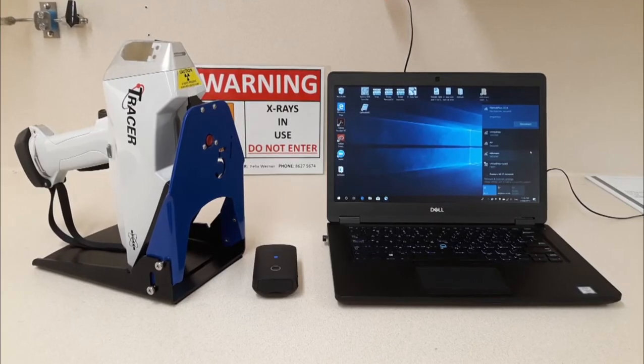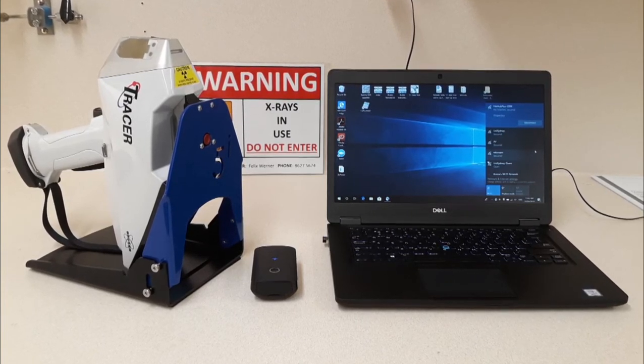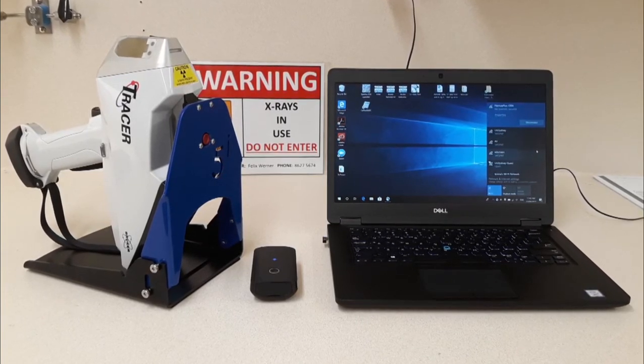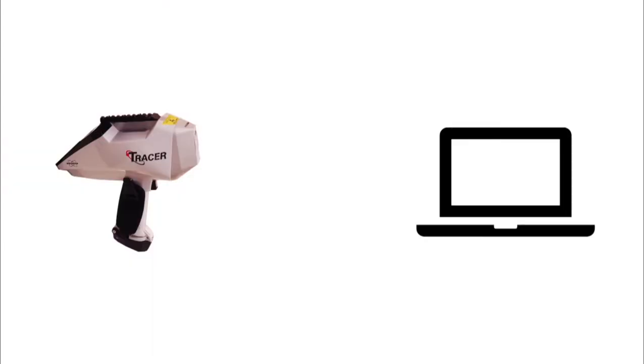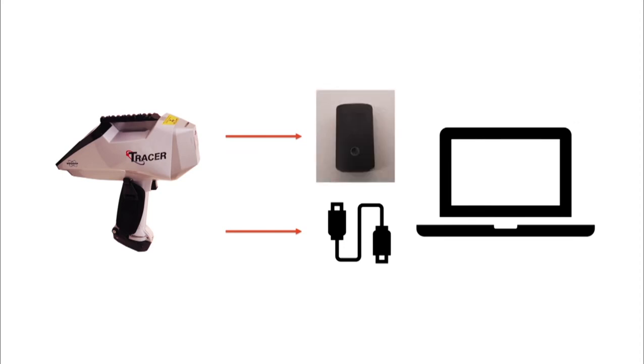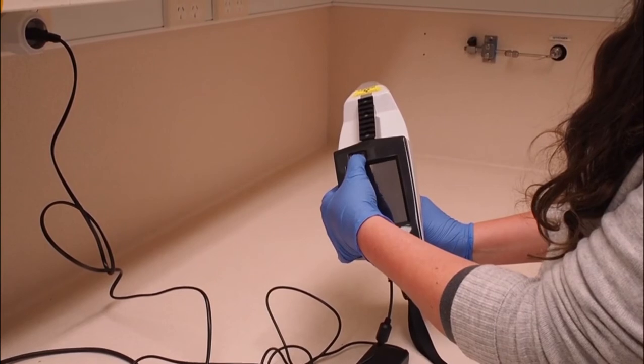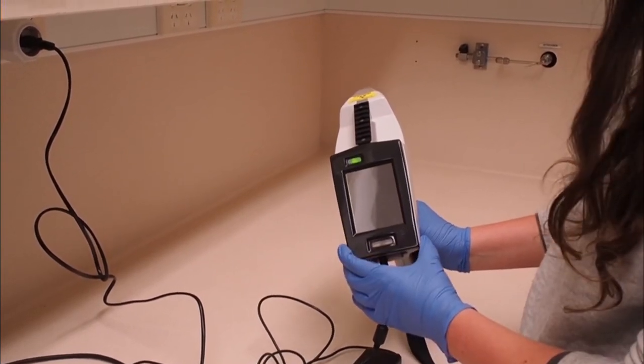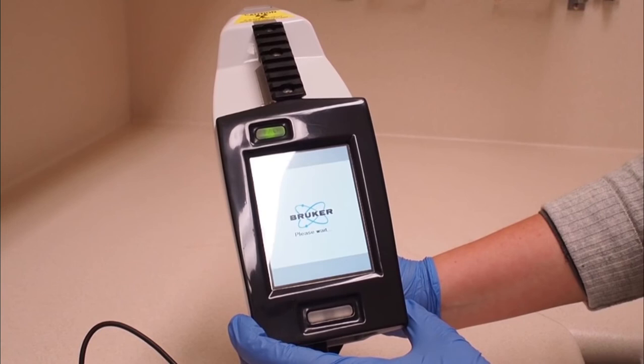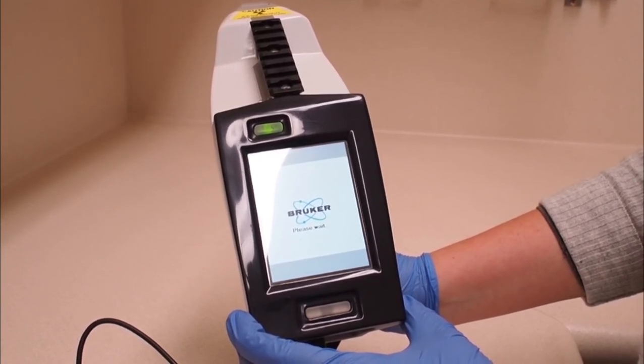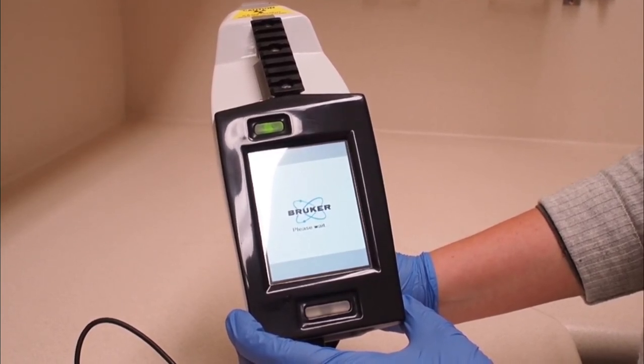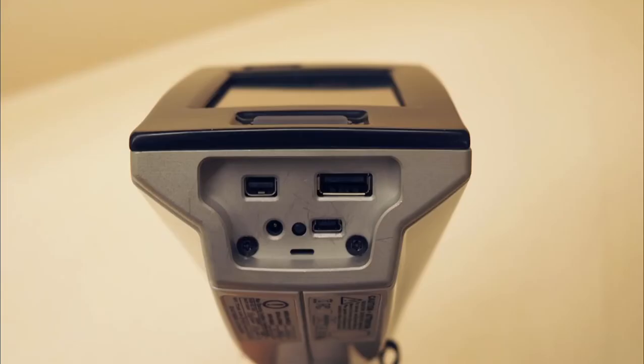If you are operating the instrument from the computer, make sure that the instrument is safely and correctly set up. You will then need to establish a connection between the instrument and the computer. You can do this using either the ethernet cable or by establishing a connection with the filehub router. Turn on the instrument using the power button located on the top left corner above the control or display window and ensure that you have given it 10 minutes to warm up. If connecting by USB, simply plug in the USB cable into the instrument using the port located here at the back of the instrument and a USB port on the computer.